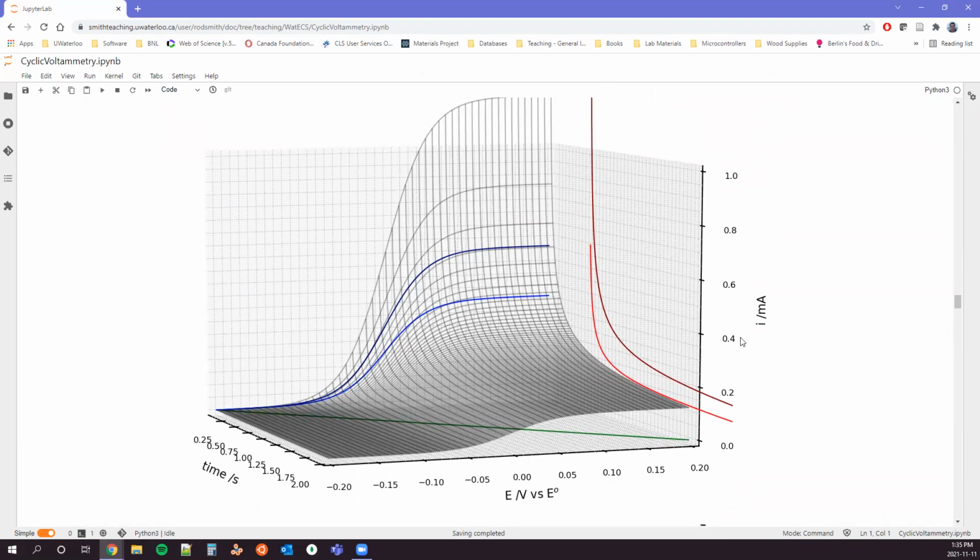What we've seen so far is chronoamperometry. We're looking at time versus current for a given voltage. The two samples that I plotted up above are broadcast onto this two-dimensional plane, right? If we look on the I versus T plane, we can see that Cottrell equation very clearly. If we broadcast instead onto the thermodynamic plane here, now we're looking at current versus E, the relative change in speciation at the surface. We have that sampled current voltammetry broadcast onto this back plane, right? We have the dark blue and the light blue on that back.